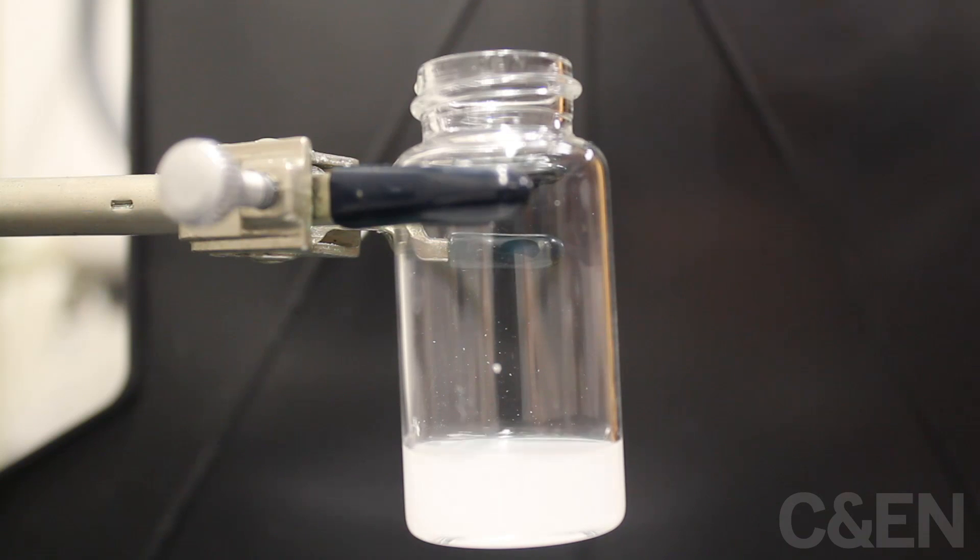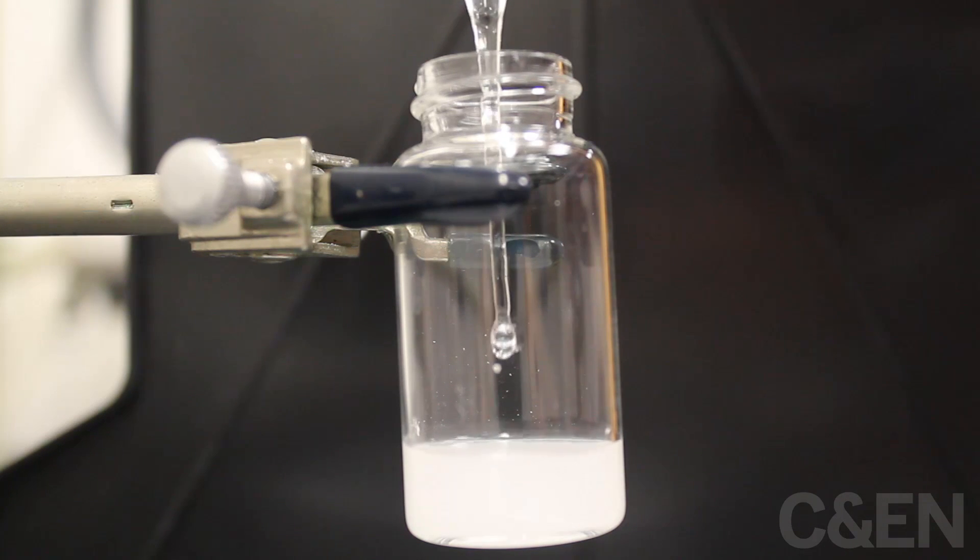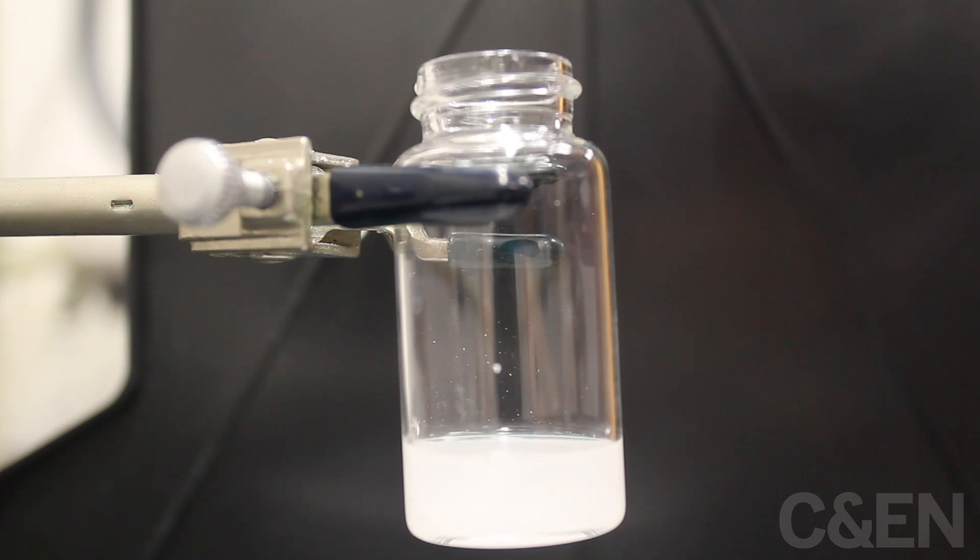Next we'll add diethanolamine by pipette, and what you'll see is the solid will go into solution and then it'll come out as a precipitate, and that's the DABO boronate.